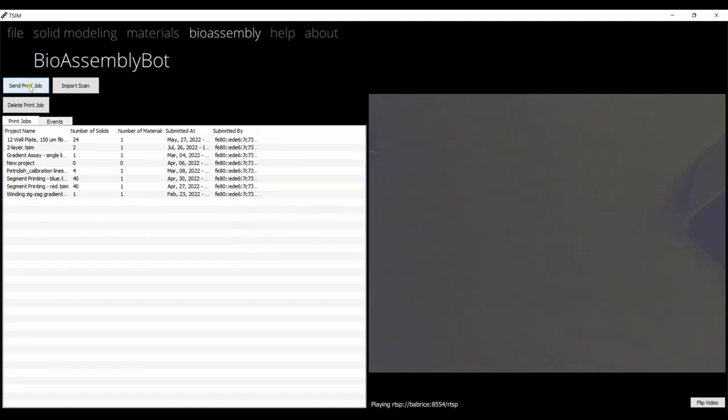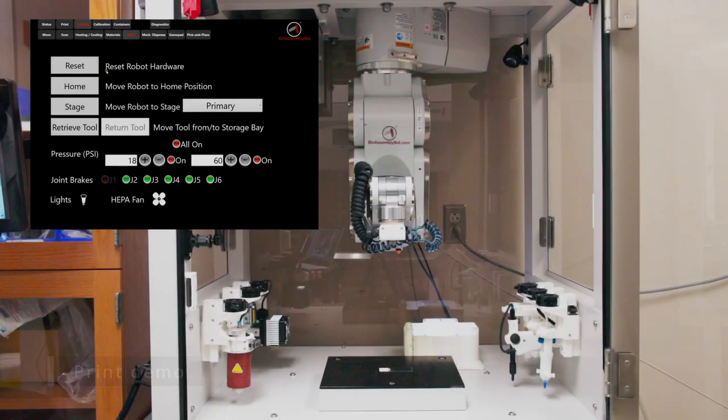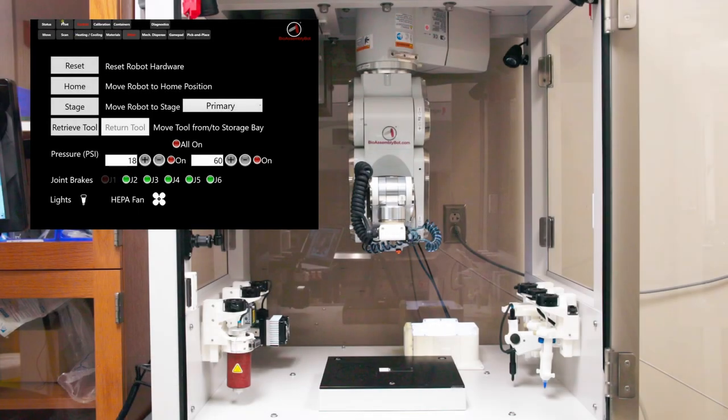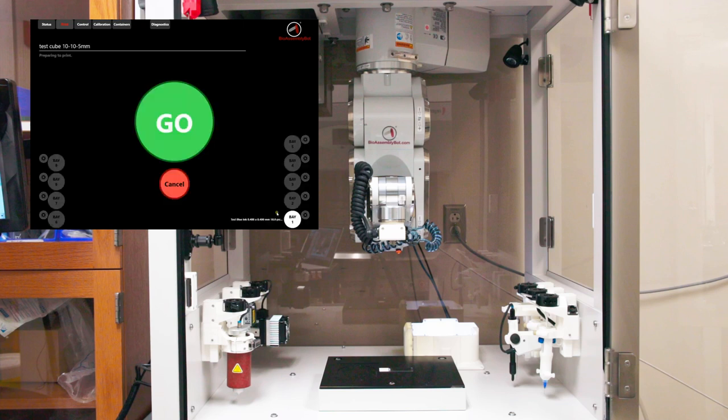Click on BioAssembly menu and click on Send the print job. Here, we can see that the print job has been sent to the printer. Go to the print menu and select the print file we want to print and click Start. Once the Go option is available, click Go.